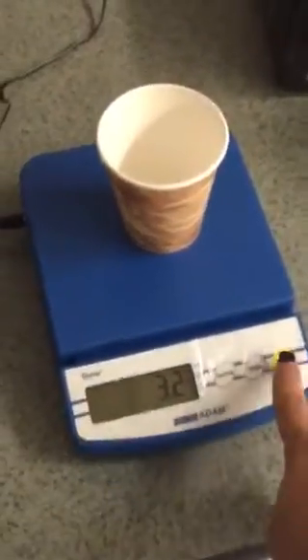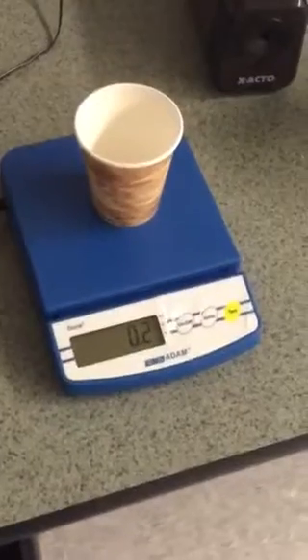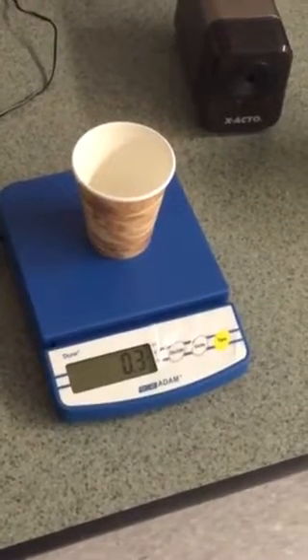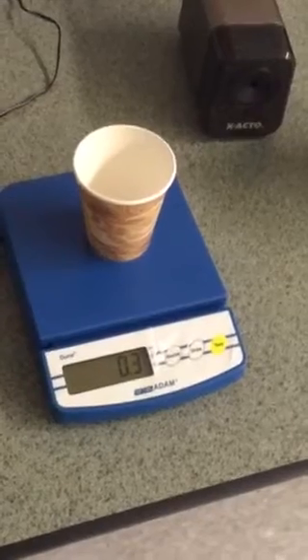You next hit the tare button and have it clear out. Do not be alarmed that it reads 0.2 grams — the scale is just picking up on a little extra movement in the classroom. It will not affect our data in a large way.